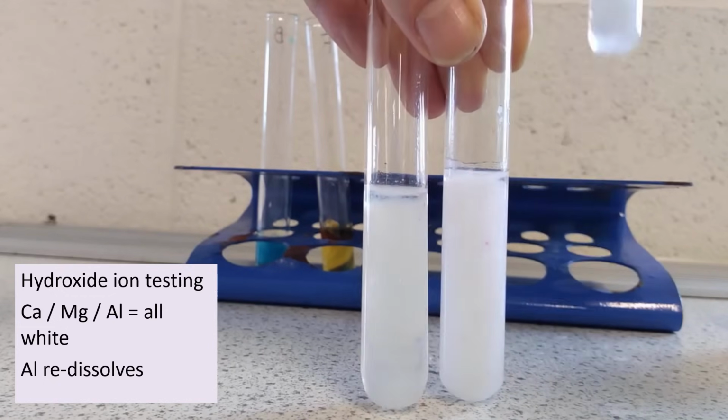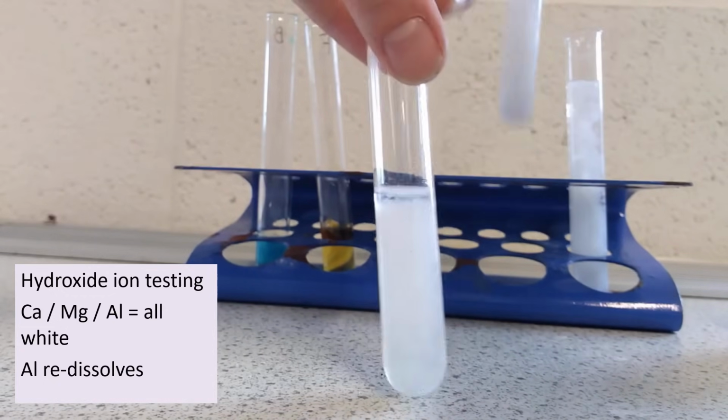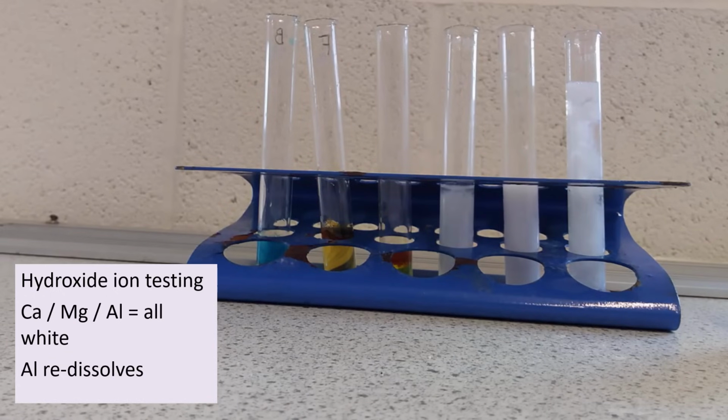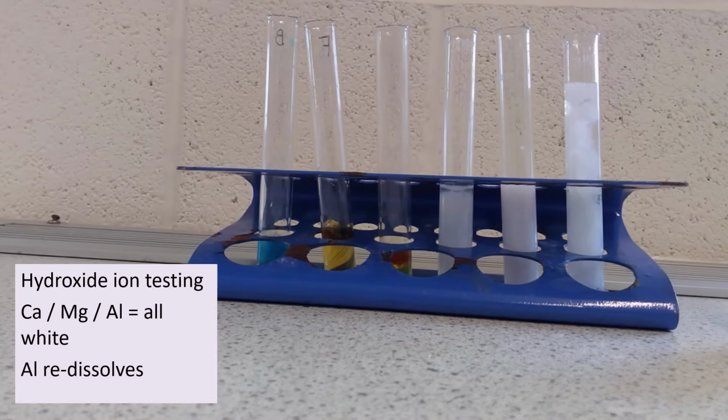Now, if I wanted to tell the difference between the calcium and the magnesium, there is a way I can do that, and I could use a flame test, because obviously when I put those compounds into the clear part of a Bunsen burner flame, I would be able to see that the calcium compound would give me a nice brick red, orange red flame.